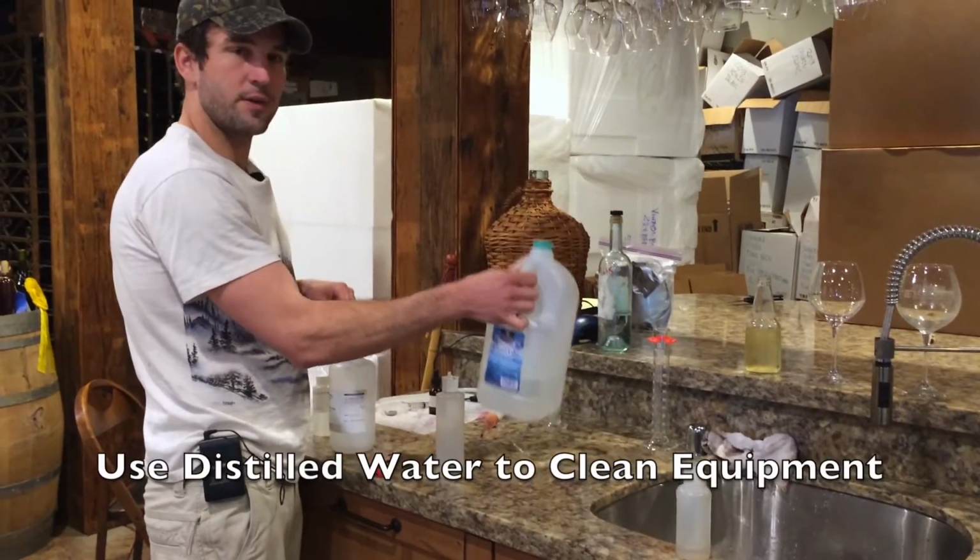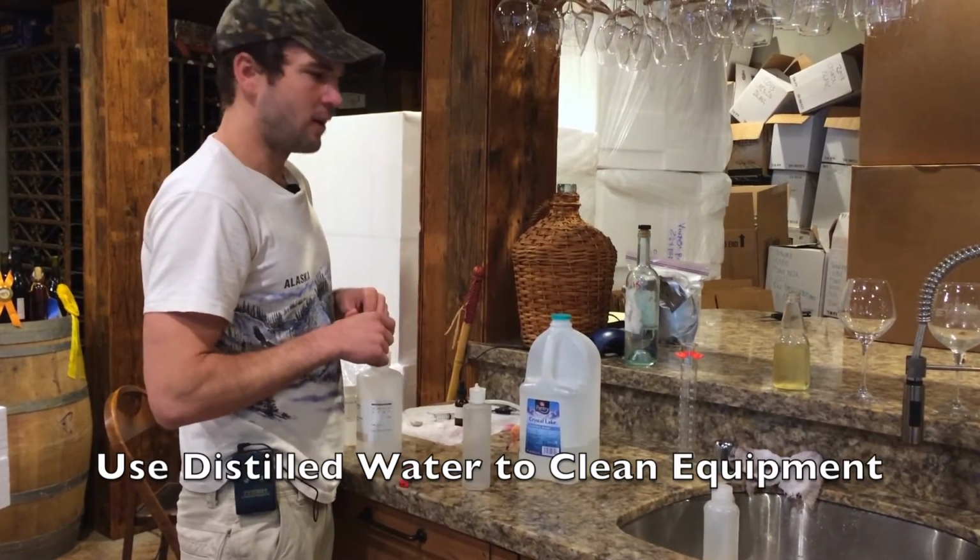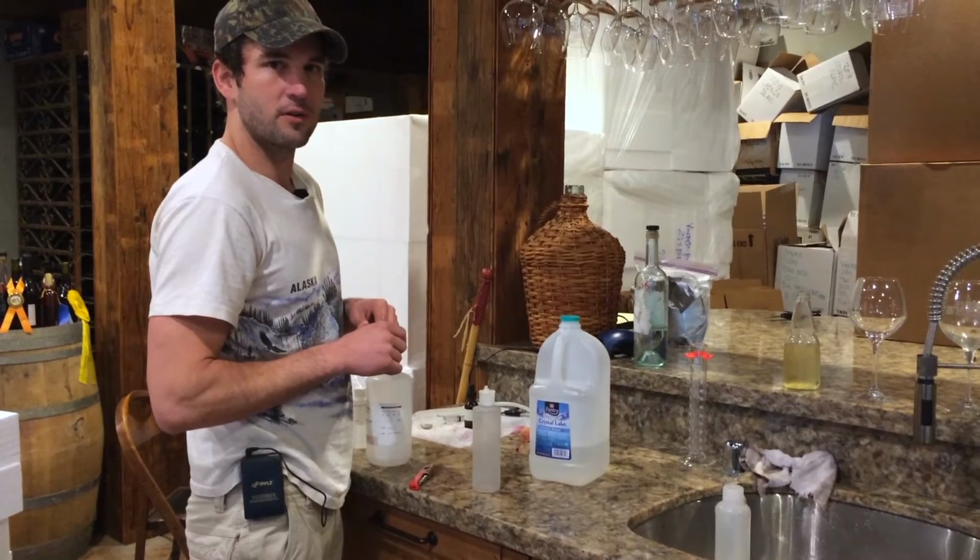When you're doing these tests and rinsing off your instruments, it's important that you use distilled water. If you use tap water, you can get some different chemicals and mineralities in there that will throw off your test results.